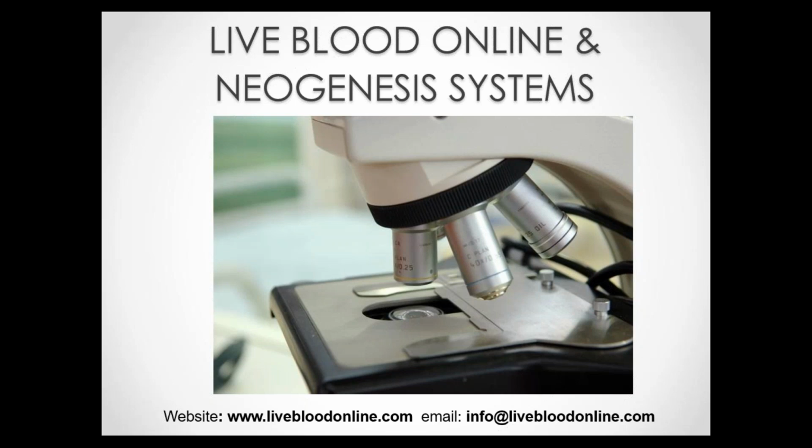Well, to benefit from live blood analysis, you would firstly need a really good course, a fairly high standard of training with as much information as possible. The theory is really very important, but the practical aspects of live blood analysis are also equally important because, as you might imagine, if you're not able to take blood samples correctly, then your results won't be reliable. Now, your course needs to be comprehensive, and the equipment that you use, so your microscope system, needs to be up to the correct specifications, so you're able to use live blood analysis to its full potential from the beginning.